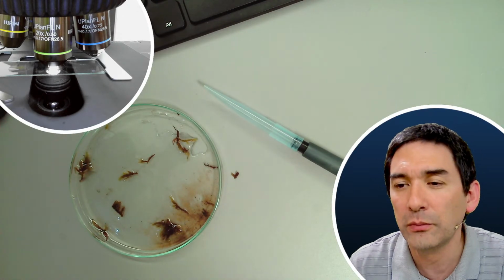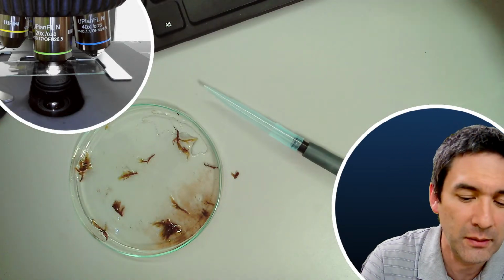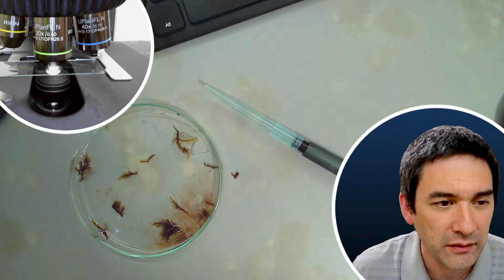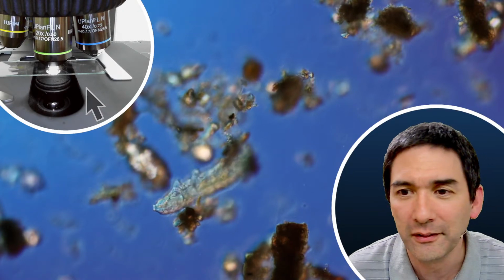A mini vacuum cleaner to clean the slides? Difficult, because what happens is that when it starts to dry up, the dirt starts to stick. Let's have a look again. Yeah, it's still here and happily moving.